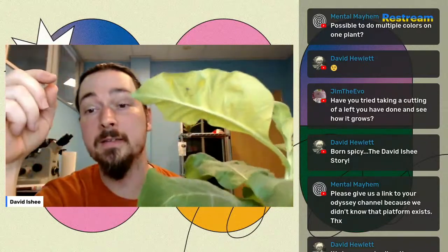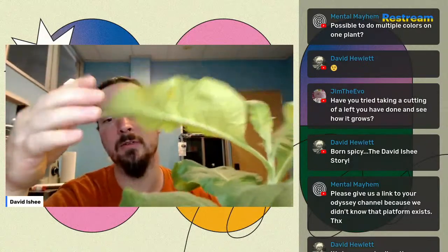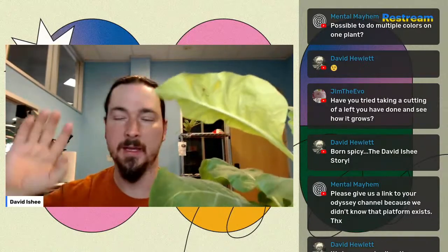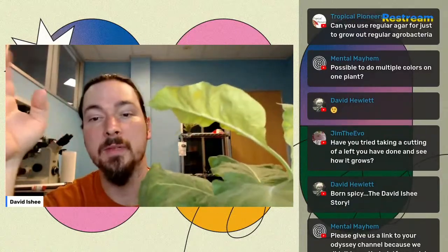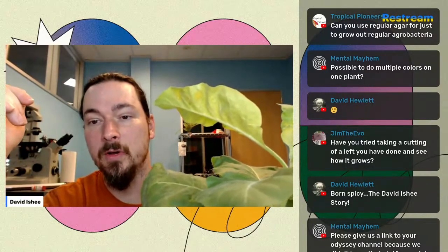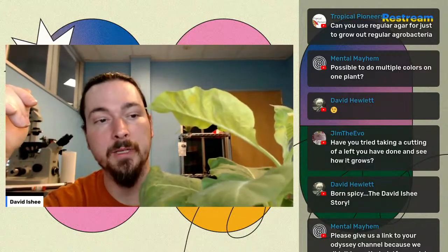Now, yes, it is possible to produce multiple colors on one plant. If you had the genes for multiple things, yeah, you could do red and green and yellow if you had carotenoids or something like that, or purple or something like that. So you could use a bunch of different stuff. Can you use regular agar to grow out regular agrobacteria? Yes, you can. They'll grow just fine on LB.